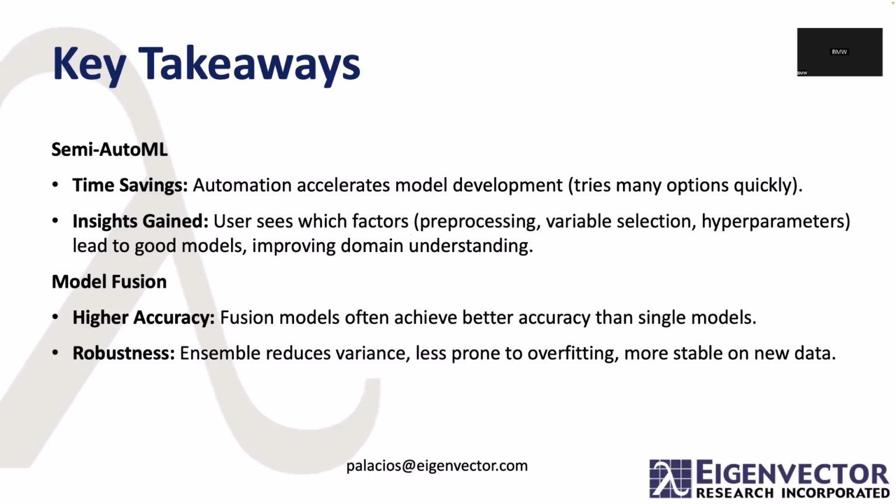Sometimes we see that only methods that include something to compensate for scatter correction work, so that's a key issue in your data set. Also, do they hone in on the same variables, and what's a typical number of latent variables in the model? I think all of those are useful information about your data set. So we hope it gets you to good models and improves your understanding of the data at the same time.